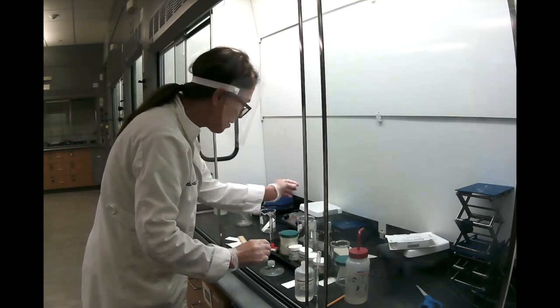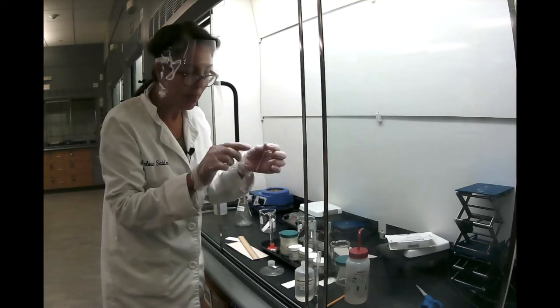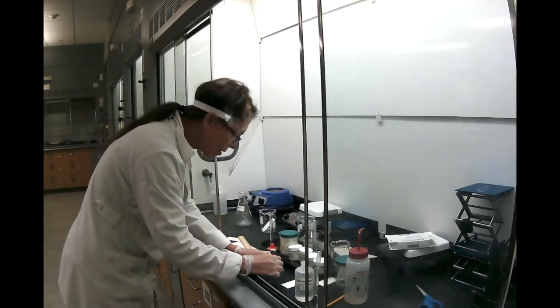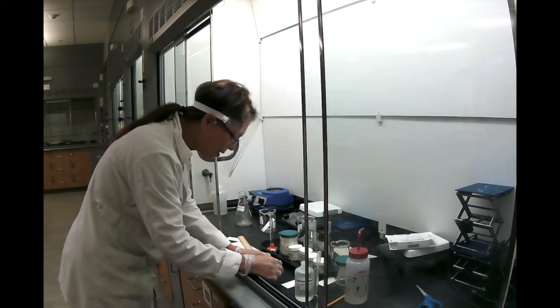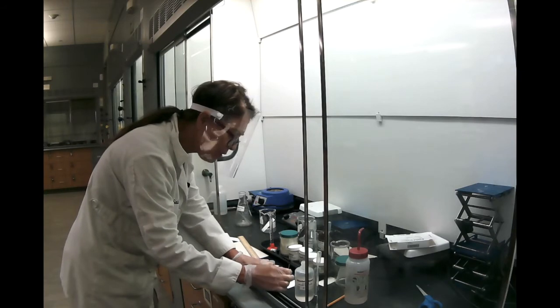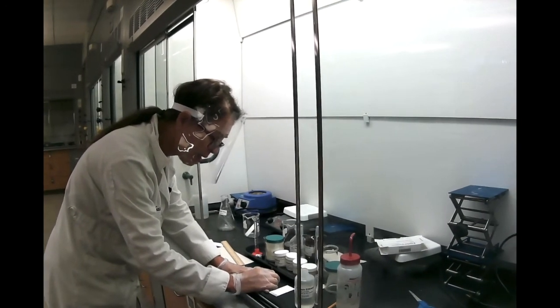And then you're going to use a capillary. It's a capillary that's open-ended on both sides. And you're going to dip, make sure that you dissolve your substance. It is soluble. And you just barely touch your TLC plate with that liquid.